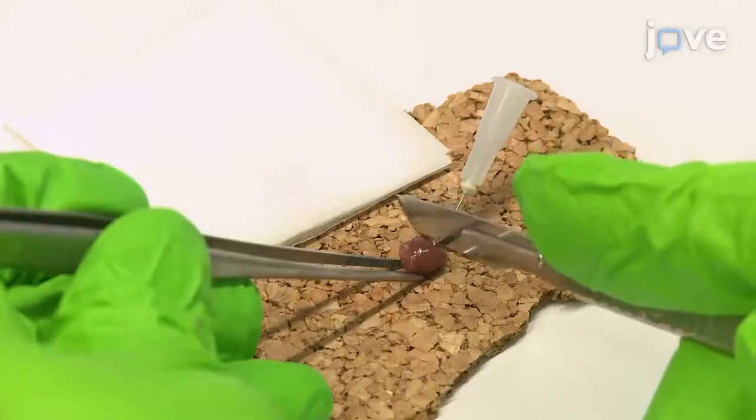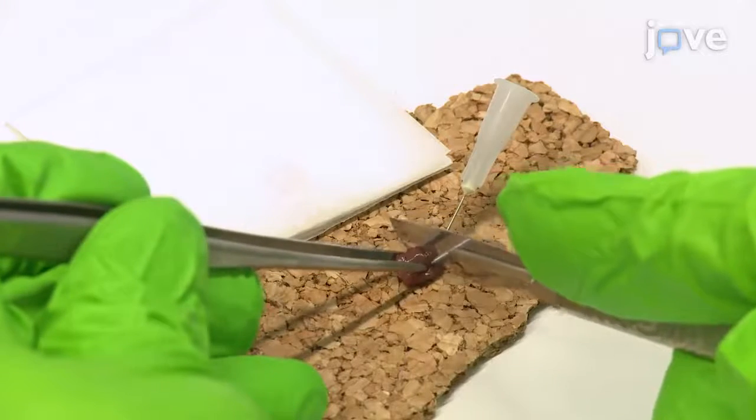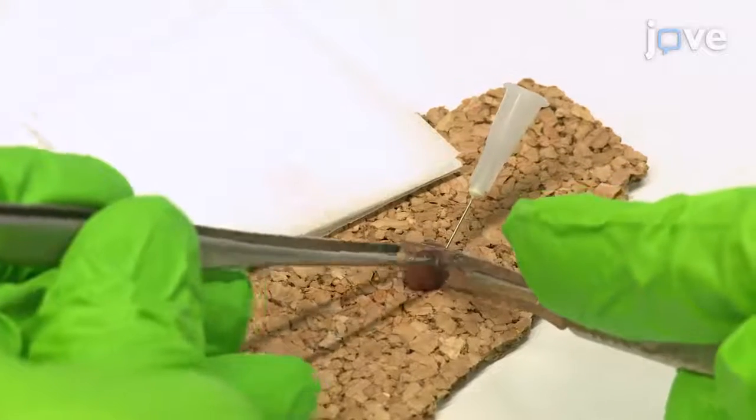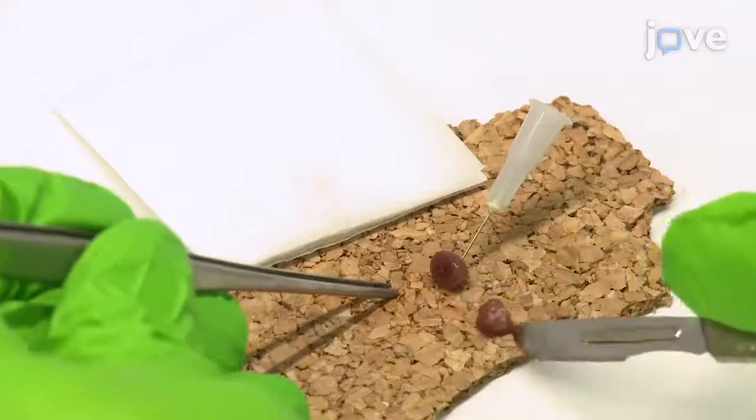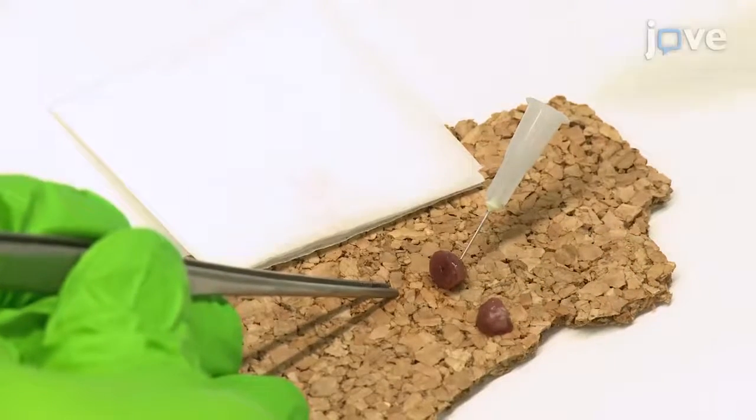Holding the base of the heart with anatomical forceps, use a scalpel held at a 20-degree angle caudally in the sagittal plane and 20 degrees cranially in the transversal plane to cut away the apical 2/3 of the heart.